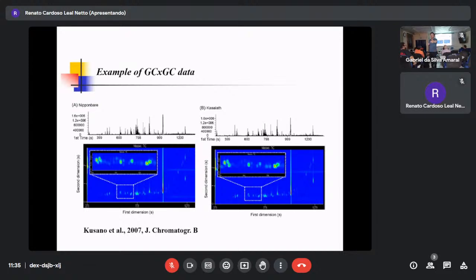You add it, and that overlapped peak can be separated by the second column. So this times this. Now, the second column is here. When you do this, it's almost different, but it's just separate. But this one is being used quite often.